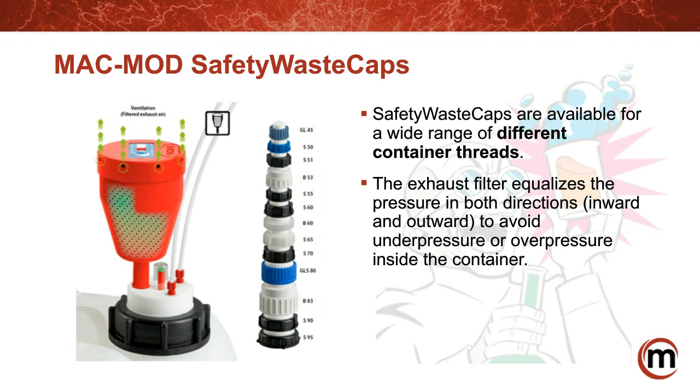Okay. And we have time for about just a couple more. Do you have fittings for tubes that are thinner than the traditional 3.2 millimeter size tubing? For the needle washes and seal washes, the tubes tend to be thinner. Yes, we do. We have 1.6 millimeter tubing and 2.3 millimeter tubing. That would be for these needle washers, and it happens with the waste container and solvent bottles as well. We do have fittings that fit any tube, and it is really important to find the right fitting for the right tubing, otherwise you'll have leaks through the loose fit of the tubing inside the fitting. Right. You certainly don't want that.